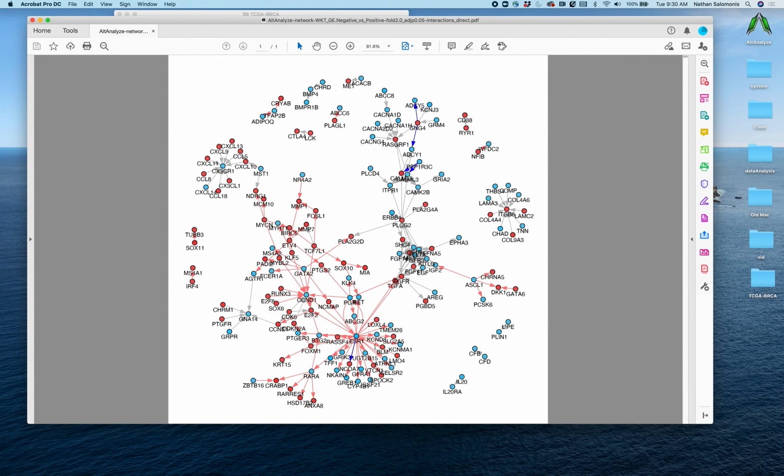These red arrows indicate putative transcriptional regulatory networks. These are basically ChIP-seq-based predicted interactions, or regulatory interactions from other databases. Its targets are also downregulated, and you can see other nodes in this network, including genes associated with cell cycle. So there's a lot you can get out of AltAnalyze. This is really just a small taste. But if you have questions, contact us.